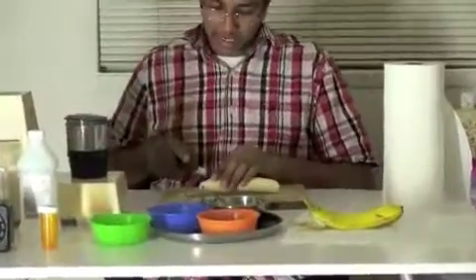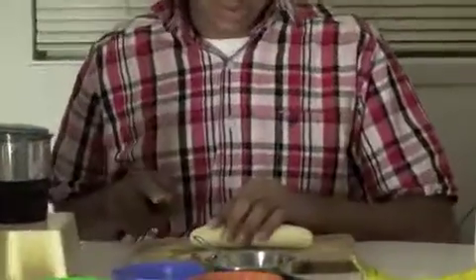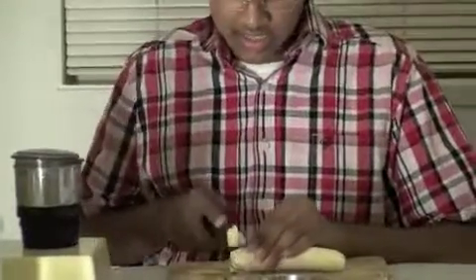Hello. I'm doing the exact same experiment as Aditya, except I'll be telling you a little bit more about what's happening when you're adding all the ingredients we're adding. And I'll also be using a banana instead of an orange. So the first step, same as Aditya's, is to cut up the banana. Or in Aditya's case, orange. So I'm just going to cut this up.